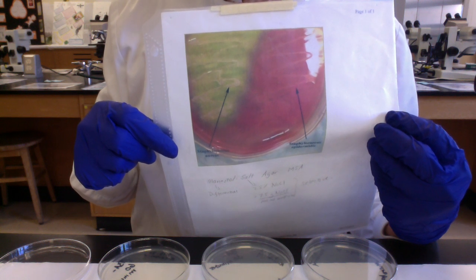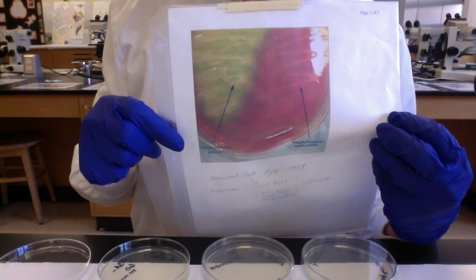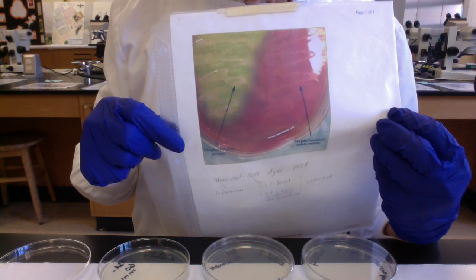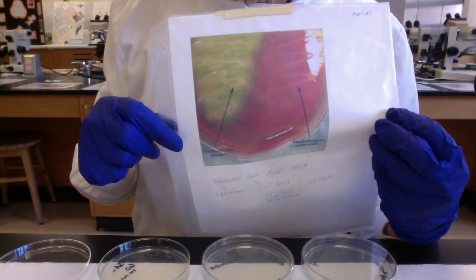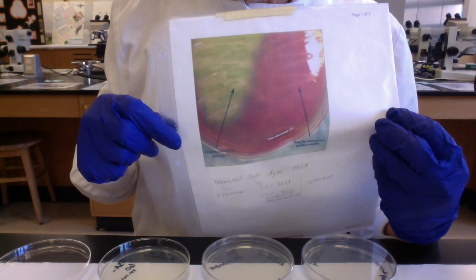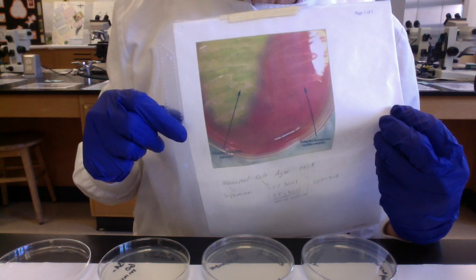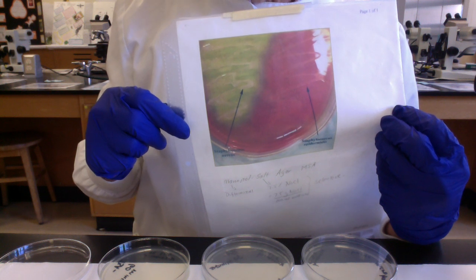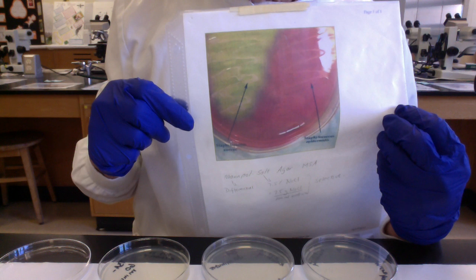So, for example, on the lab exam, if I asked you how much sodium chloride you would add if you're going to make a liter, 1,000 mL, of MSA, mannitol salt agar, you'd say 75 grams per 1,000 mL, and that's going to give you 7.5% weight per volume of sodium chloride. All right, so that high sodium chloride will help inhibit most microbes. We're going to select for the growth of Staphylococcus.